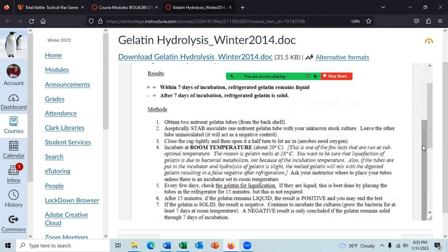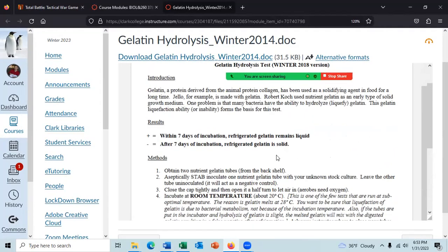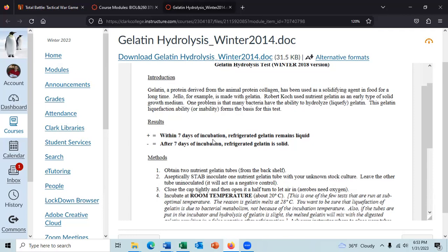What's important about this is it tells you how long the test will run. And the gelatin hydrolysis test, or the gelatin test, takes at least 7 days of incubation from once you start the test before you get the results. So if you want to do the gelatin hydrolysis test, it will run for a week before you will get the results. And when you request a test, I will set it up for you and then send you the results, and you will not get the results until after the incubation time.